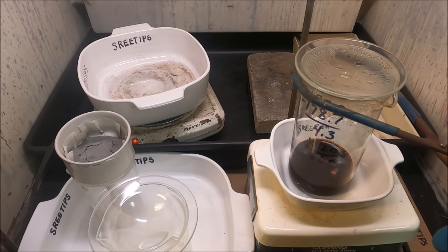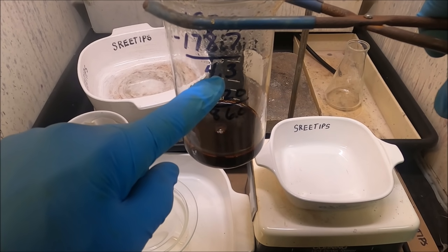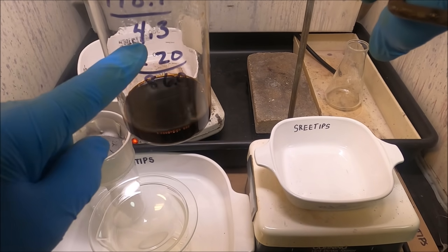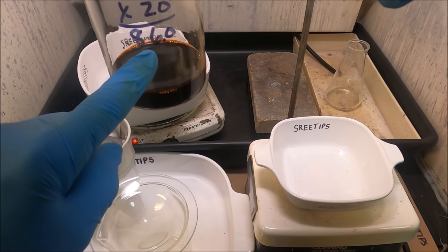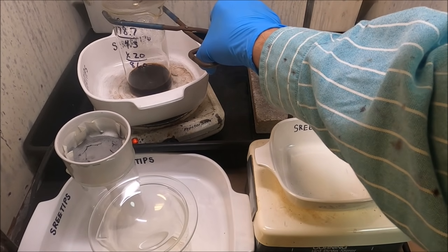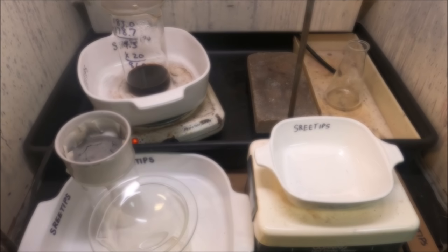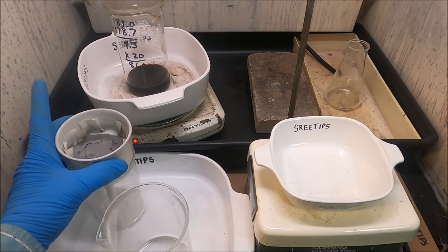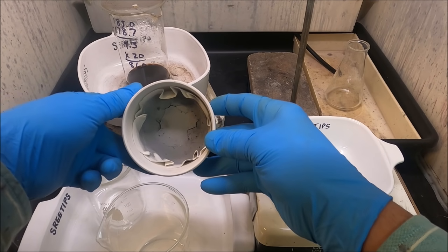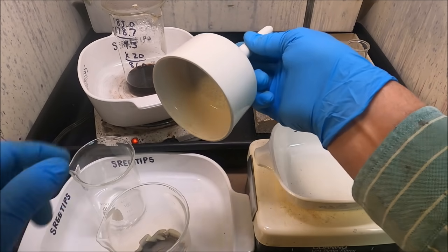I've got all the platinum group metals dissolved now. I'm trying to get 4.3 grams of material into a solution that's 20 milliliters per gram, so I need this solution to concentrate to about 86 milliliters. I'm going to transfer this back onto the heating pad and let it continue to evaporate. Meanwhile, I've got this material in this filter here — I'm not quite sure what it is, it may be rhodium. I'm going to put it in this beaker over here and add a stir bar, and stick it up here on our hot plate stirrer.